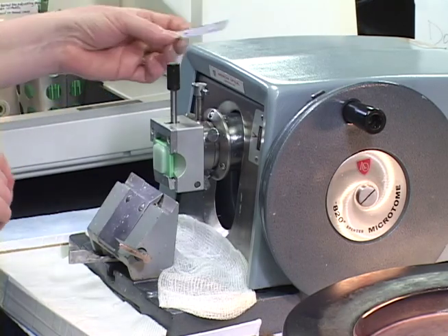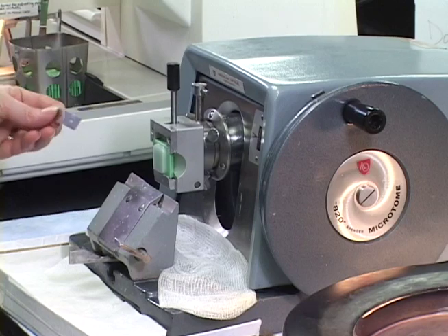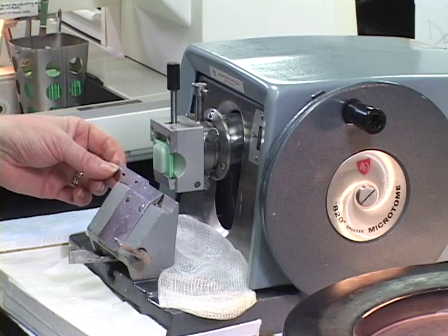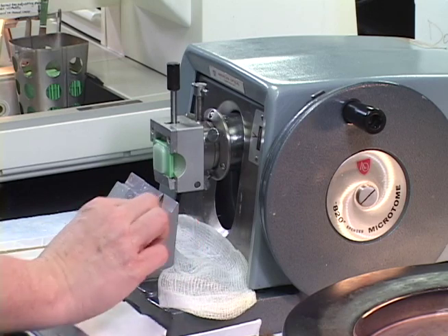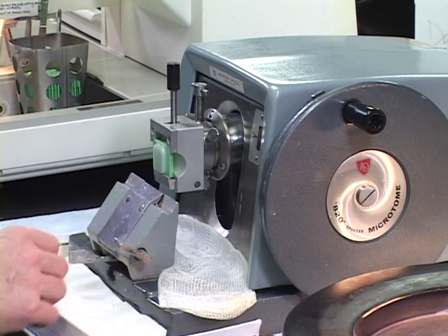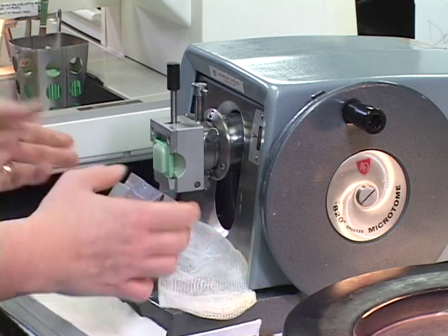I'm going to, just for our purposes, use one of our facing blades just to show you how to face and show you how to lock the knife. This is our knife clamp lever on the knife holder. This lever right here actually moves the whole knife holder if you want to clean it or whatever.